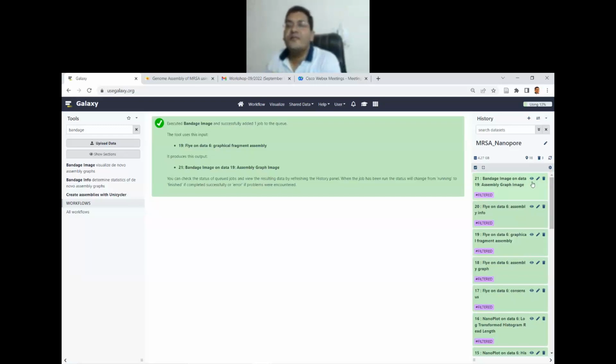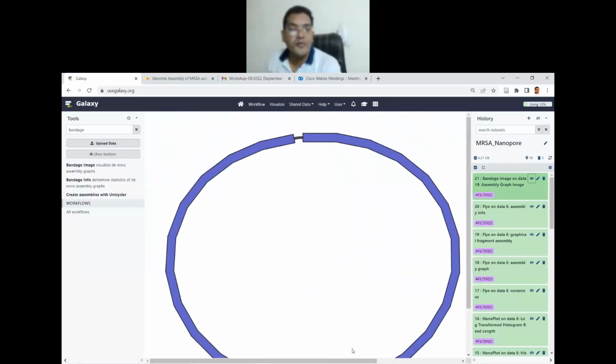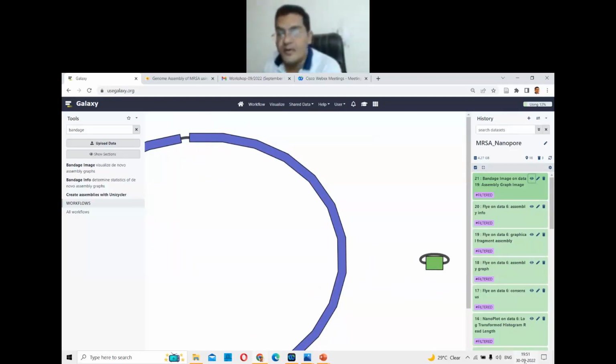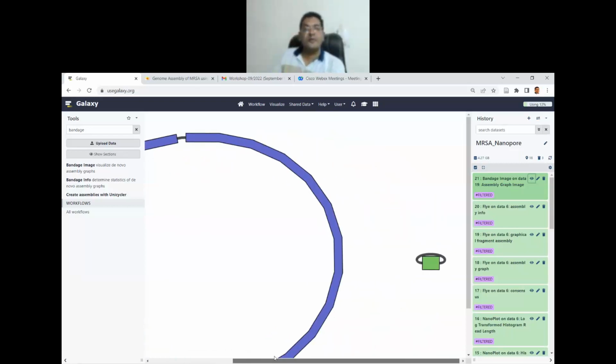So here you are. This is your data here, and you can have a look at this. This is perfectly fine. No Murphy factor here. You have one assembly here and the other assembly here. If you remember, there was one chromosomal assembly, and the other was the plasmid. Everybody, you follow? Yes, sir. So this is how it works out. In the central panel, you'll be able to see this.